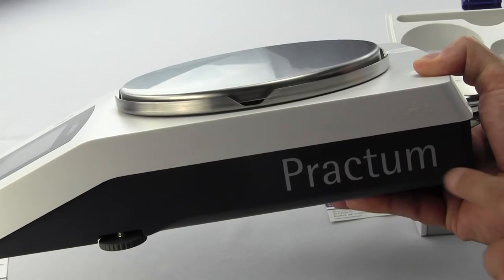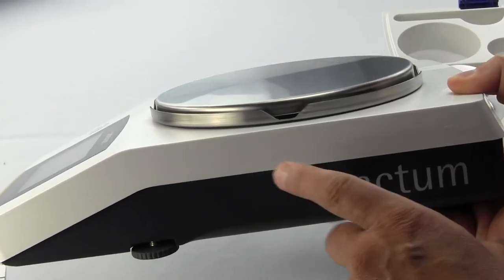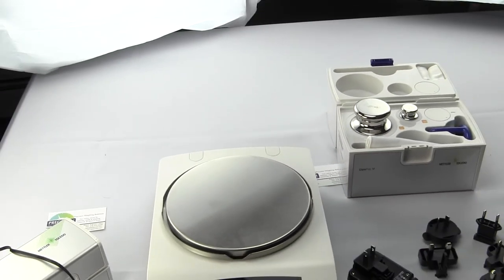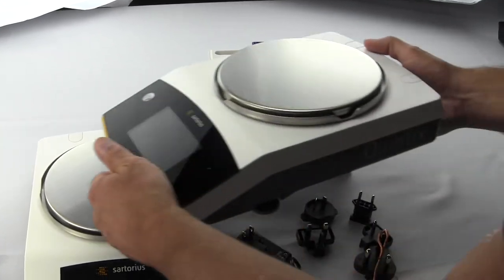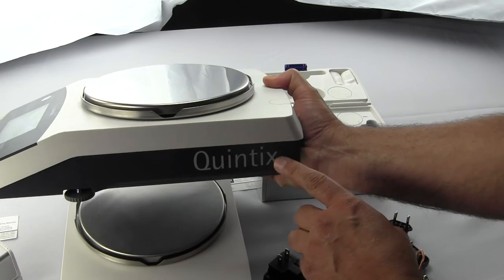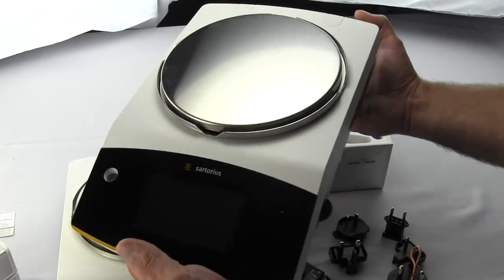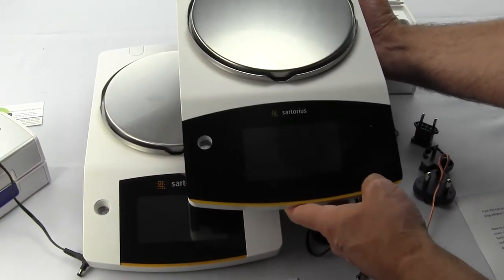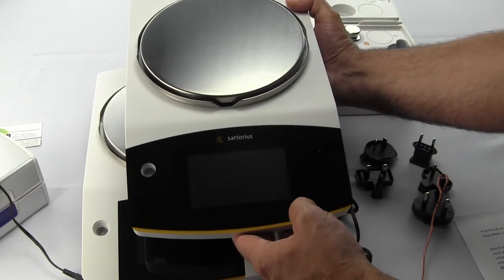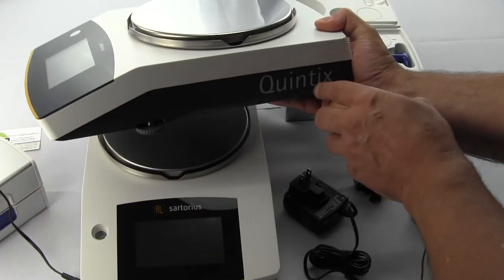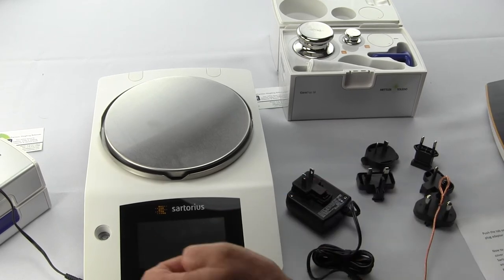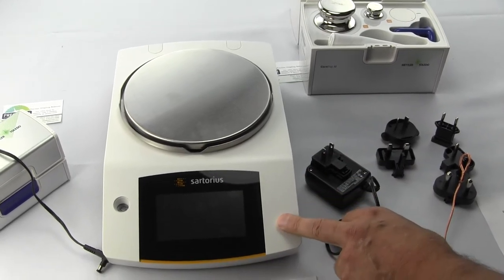On the other side you can see Sartorius has done a great job branding their products—this is the Practum. On the Practum series these are all external calibration. Just to show you the difference, this is the Quintet. The Quintet has motorized internal calibration. They've changed the overlay just a little bit, but it's the same body and housing. The difference is the Quintet has motorized internal calibration versus the Practum which is external calibration only.